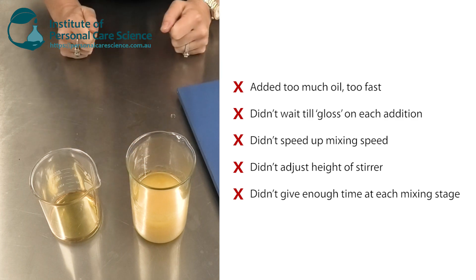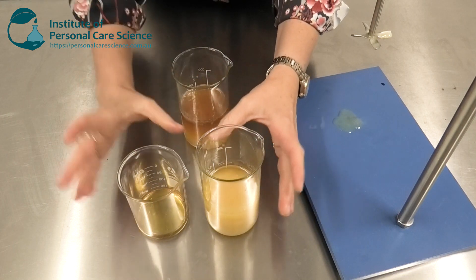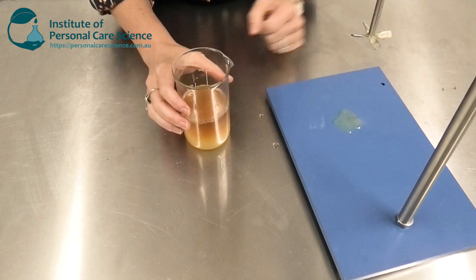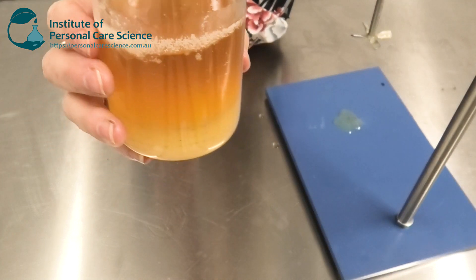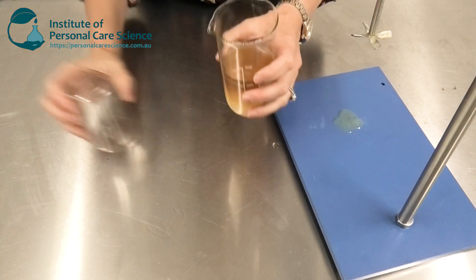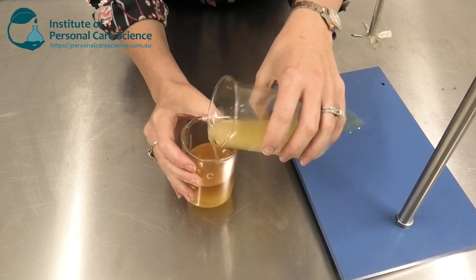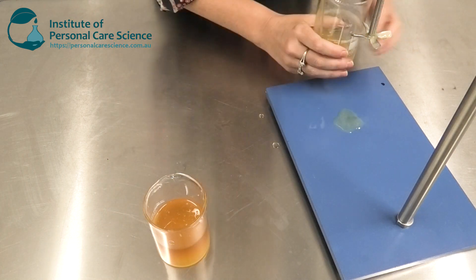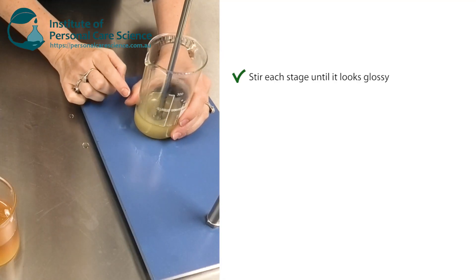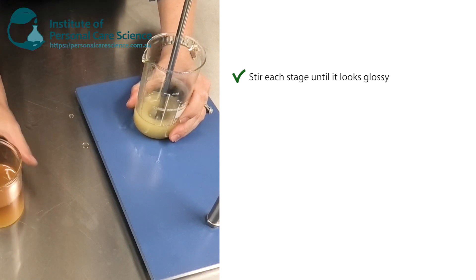Here is the same product I prepared yesterday. If you finish adding everything, give up, and set it aside, by the next day you'll see it has separated out into its layers like this. To save it, I simply need to pour off that oil phase and then set my sucragel back up for stirring. One of the first things I want to do is make sure this becomes very glossy before I start adding any of the oil phase back.